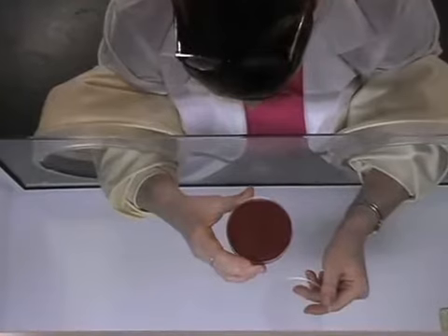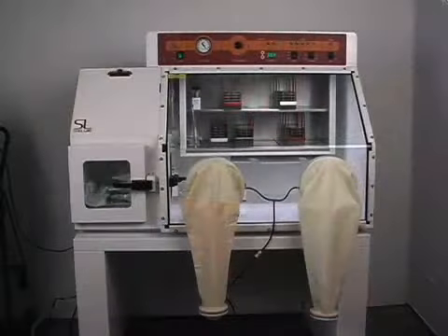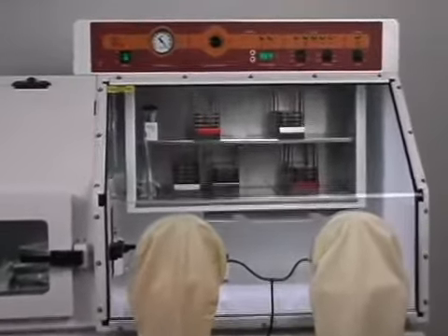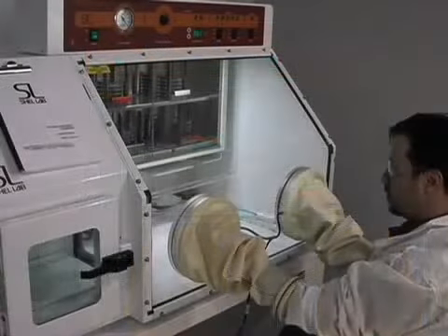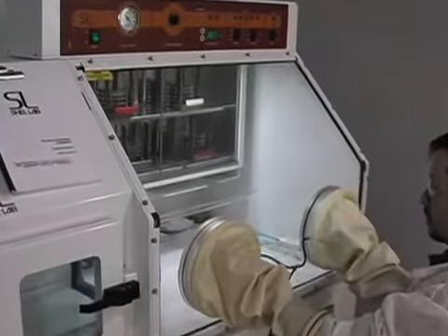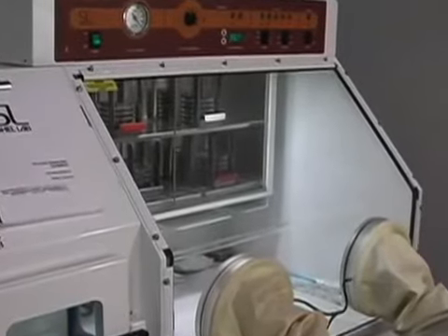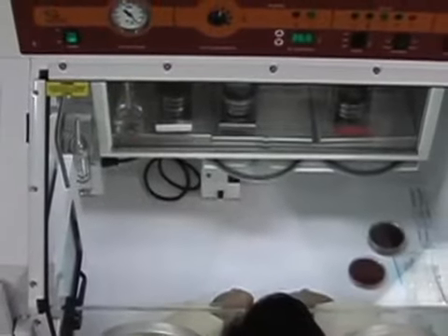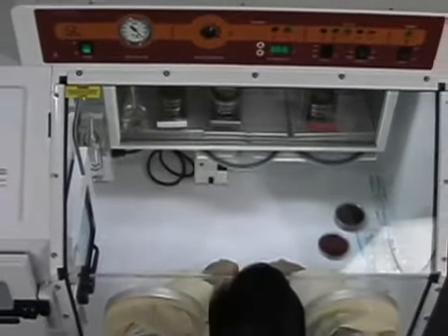Built to last, the Bactron anaerobic chamber is constructed with a rigid plexiglass front, seam-welded to stainless steel, and a baked-on powder coat finish for enhanced visibility. An interior light provides ample visibility without any glare or reflectivity. The Shell Lab Bactron chamber is also equipped with an internal outlet and space-saving shelf. A loop sterilizer and leak detector are also available options.